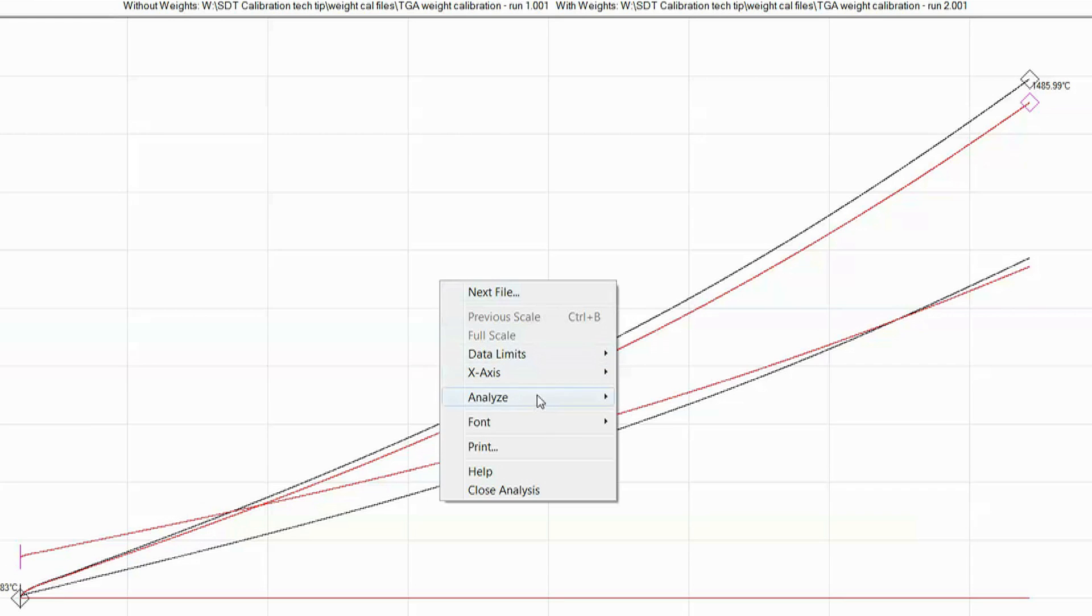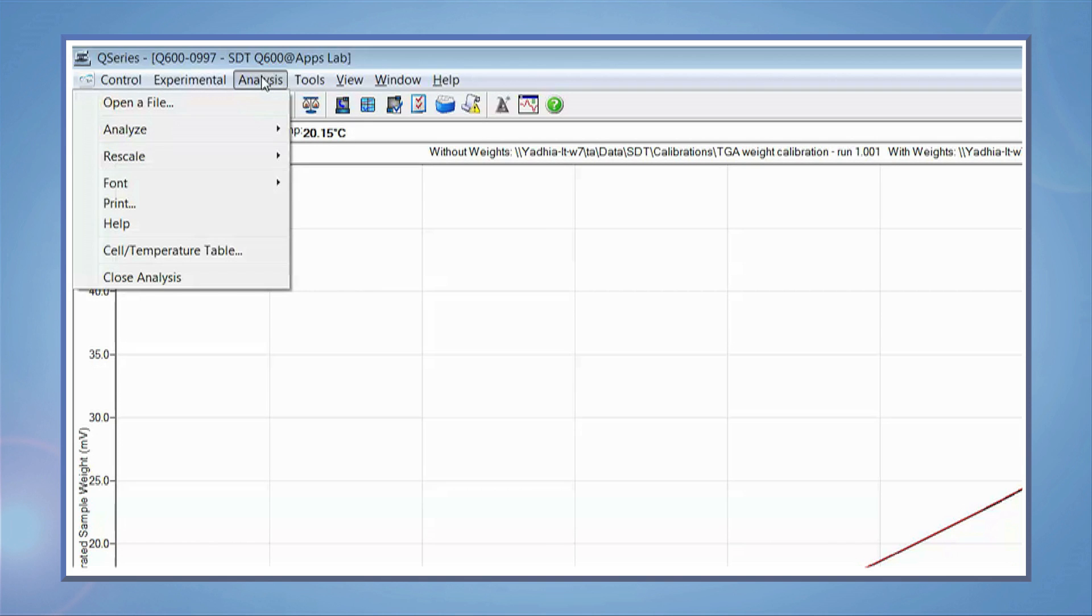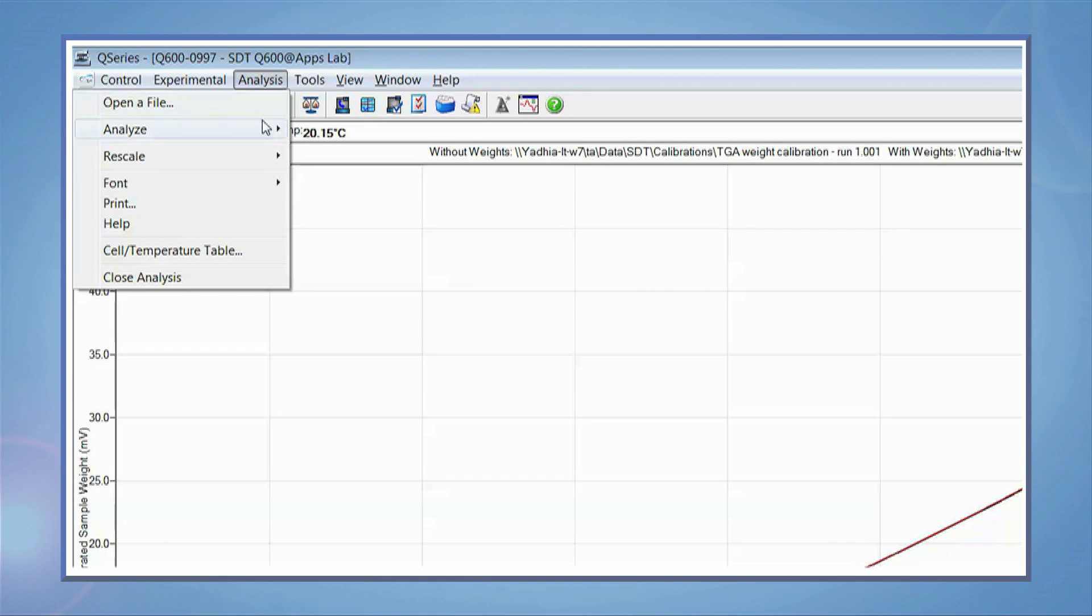Right click on the screen again and select analyze, accept results. Close the analysis to return back to the experiment window.